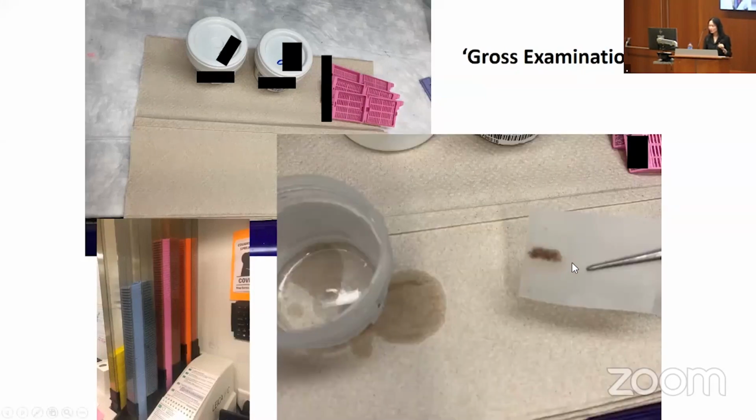And what they do is, so here's a core biopsy. It's very small. We're afraid of it degenerating and slipping through the holes. That's why we have them put it in a little mesh bag and then place it into the cassette. Then this cassette goes overnight into a processor. The processor starts around 6:30, so we'll receive these cases somewhere around 4:30. It goes into the processor. It gets fixed until it's really stiff through formalin and other chemicals flowing through these cassettes. It's basically lined up on the processor.